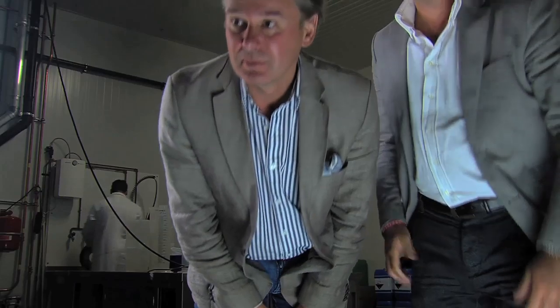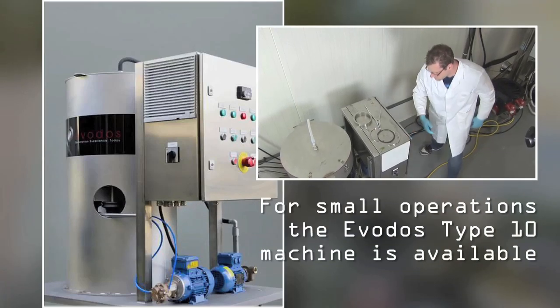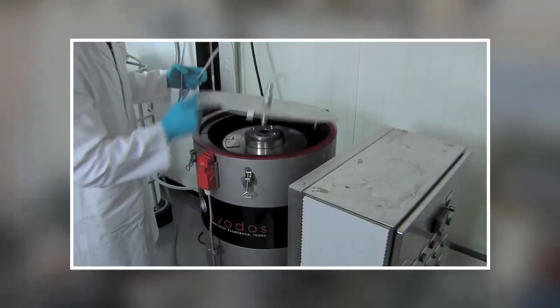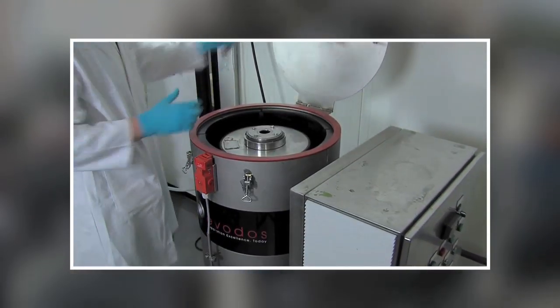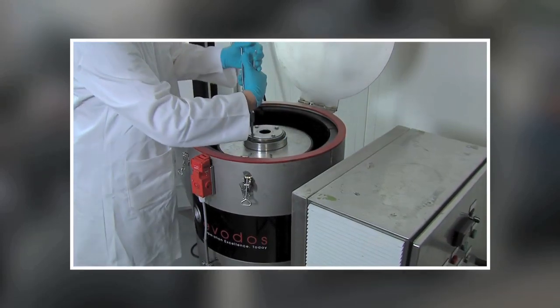Your algae will be harvested alive and without free water. For small operations, the Evodos Type 10 machine is available. Although it is only on the market for a couple of months, it already is a big hit amongst universities and research centres.